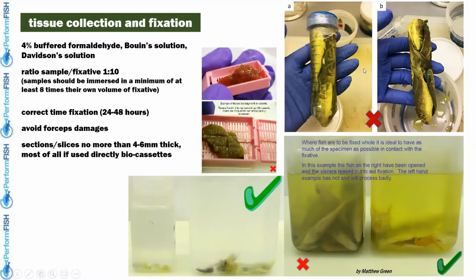In order to obtain a good histological specimen, the fish tissue must be very fresh and immediately transferred into a fixative solution in order to avoid autolysis. A good fixation is the most important step in producing good histologic slides. A proper histological evaluation depends absolutely on an excellent tissue fixation. This procedure allows us to stop cell autolysis, thus preserving the morphology of the tissue and organ under study over time. It's possible to use different fixative solutions, like formalin, Bouin's solution, or Davidson.